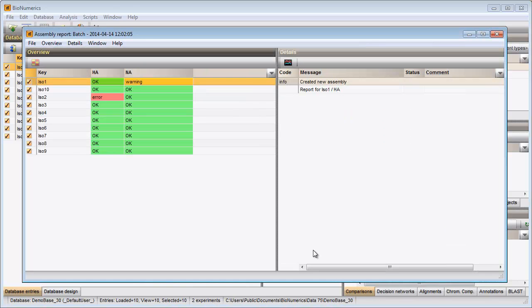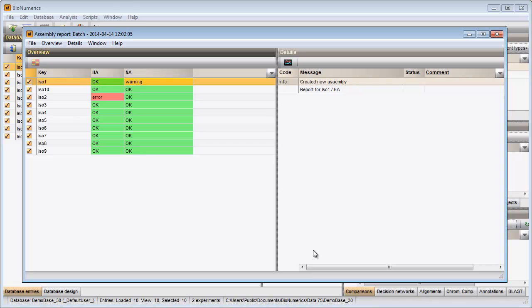The overview panel displays the entries as rows and the experiments as columns. Each cell provides information about the current status of an assembly project. In my example, most sequences were assembled correctly and the corresponding cells have a green color. One cell has a red color.